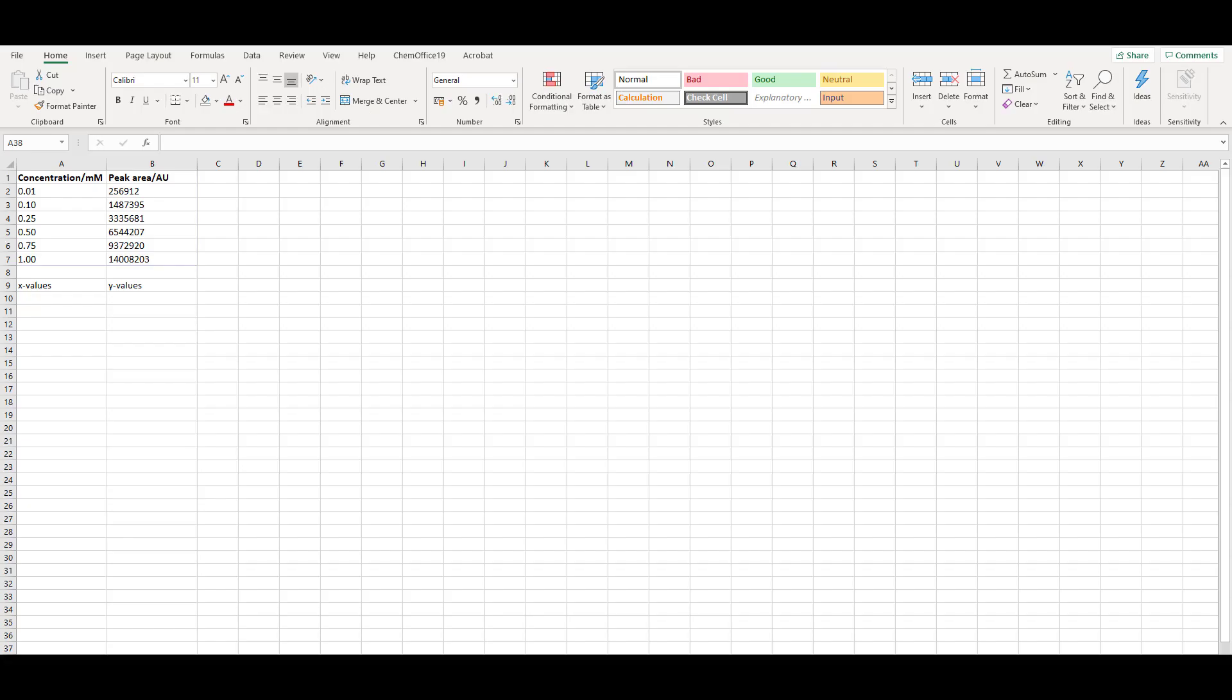I'm going to use Excel 365, but the process should be similar in other versions. Firstly, type in the data, with the x values in the first column and the y values in the second column. I've done this already to save time.